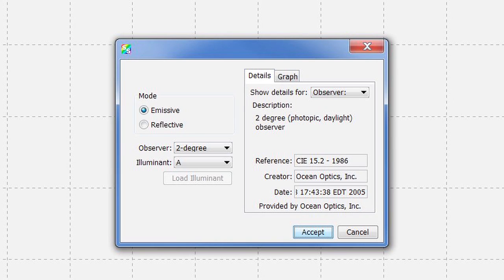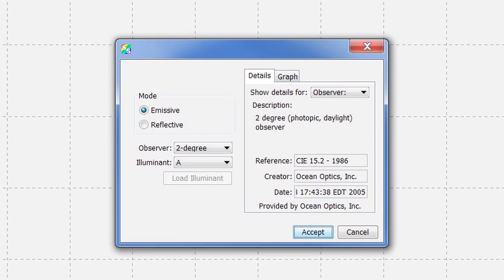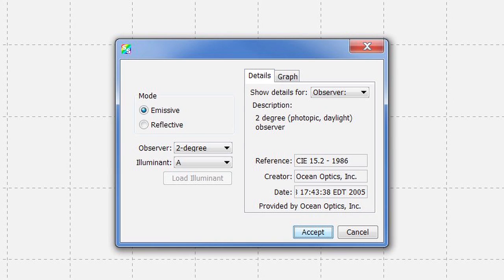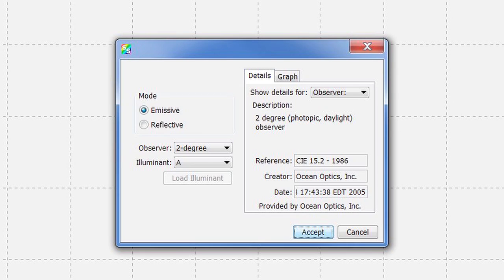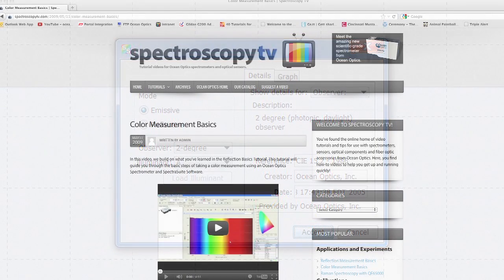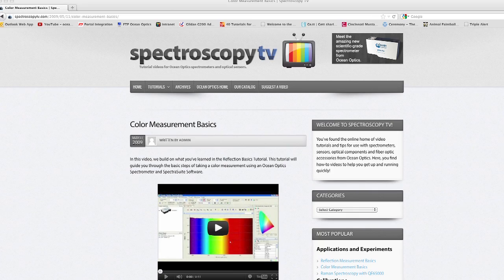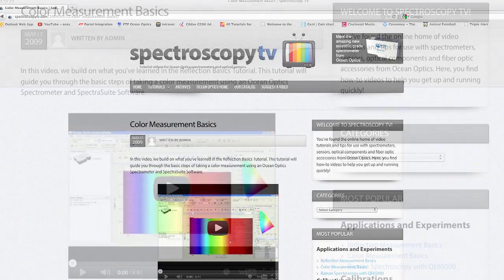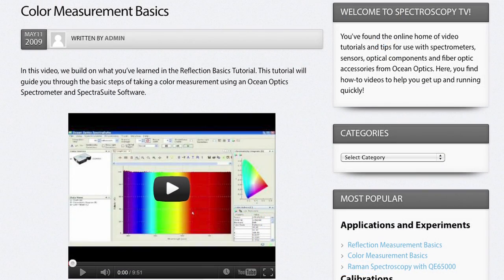The color measurement wizard will now allow you to select the color observer and illuminant. It should automatically default to Emissive Mode for your Absolute Irradiance file. Choose between the 2 degree or 10 degree observer as well as the illuminant that you desire the data to be processed in. If you do not know what observer or illuminant to choose, do some research to see which would be best for your application. We will choose 2 degree for the observer and illuminant for our tungsten halogen bulb. For more information on color measurements, please see the Color Measurements Basics video from OceanOptics on SpectroscopyTV.com.